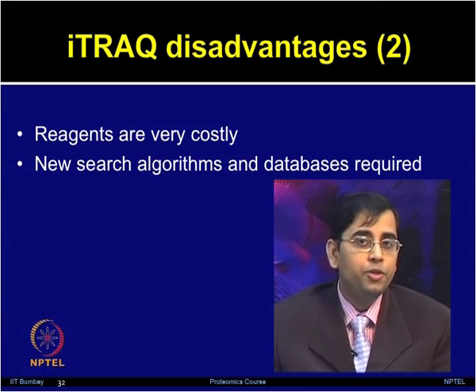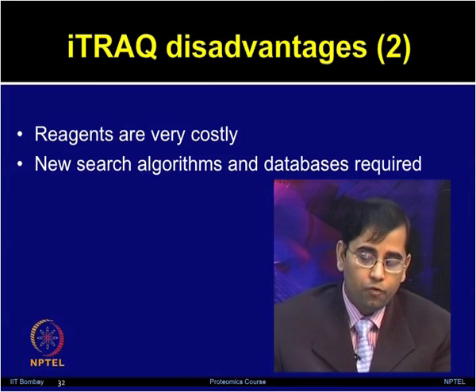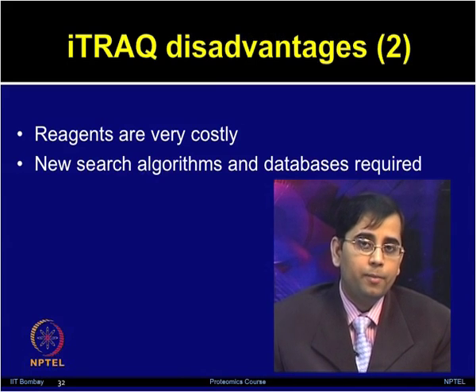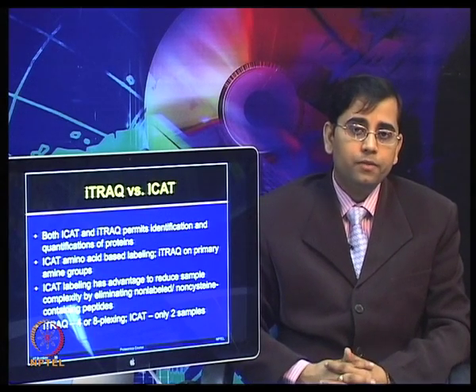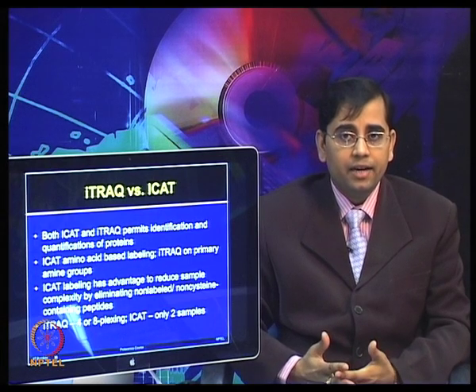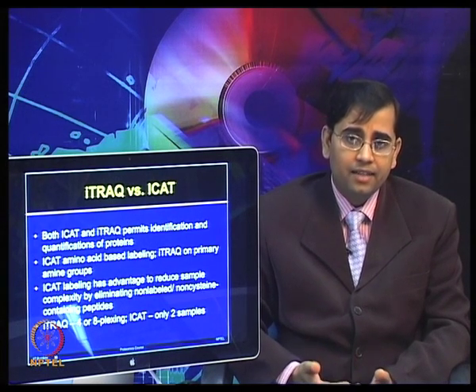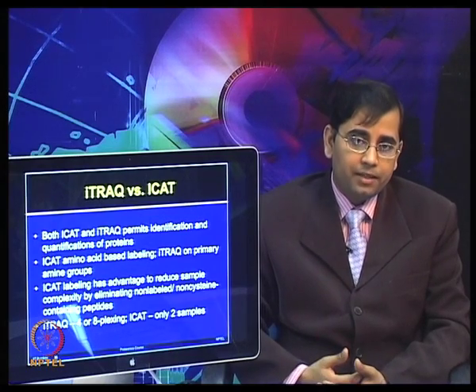Obviously, with more and more new studies happening, now we have better software and better information available for performing these experiments, but still that is one of the limitations. So, we will now talk about comparison of iTRAQ with ICAT techniques, isotope coded affinity tagging, with the iTRAQ method.